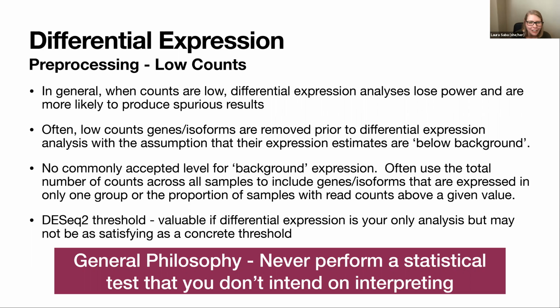The best advice here is to make some kind of cutoff that you apply to everything that you feel comfortable in. And to get on my soapbox a little bit, my general philosophy is never perform a statistical test that you don't intend on interpreting.